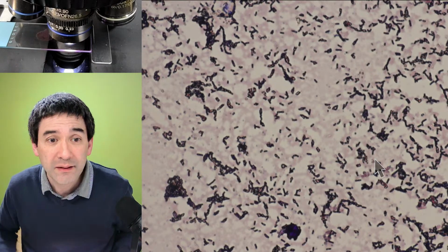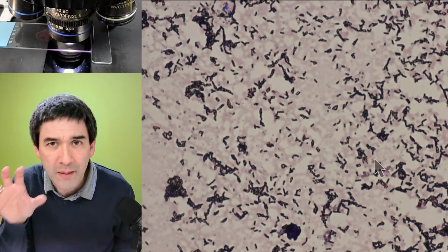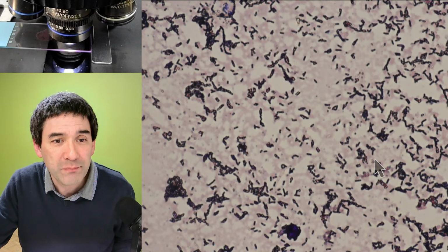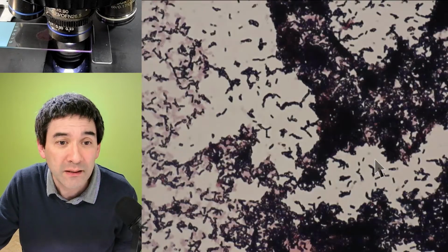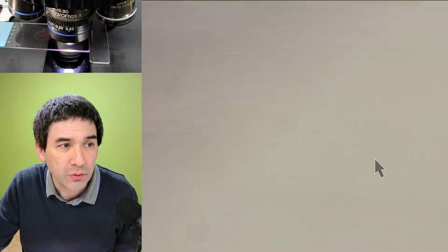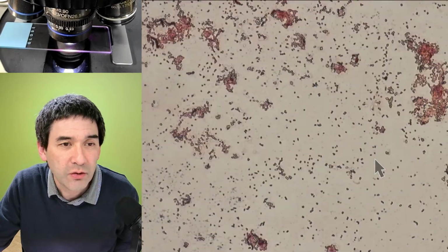Okay, I'm also going to talk a little bit about biology, how the Gram-positive and Gram-negative cells are actually different from each other. Okay, so again, these are the Gram-positive bacteria. You see that they stain dark purple, dark blue, almost black. Here, very dense over here, right? And over here on the other side, I move up, wrong direction. Here, I have to go over here. You see, yeah, they are red, right?